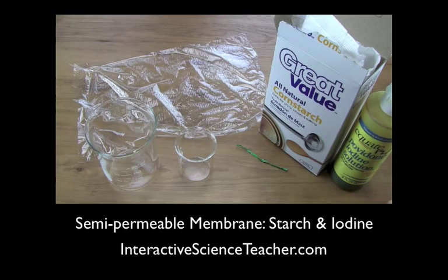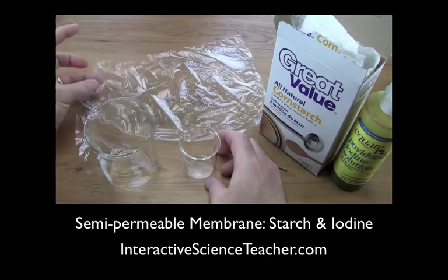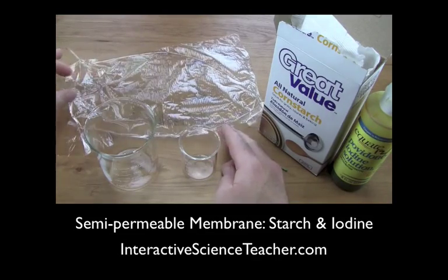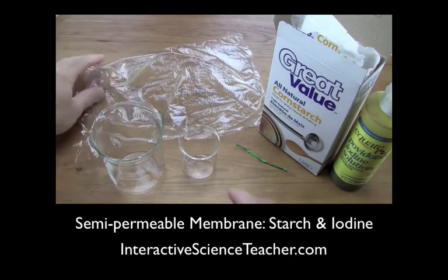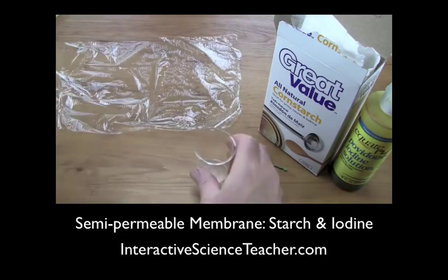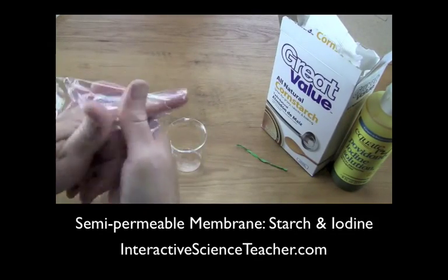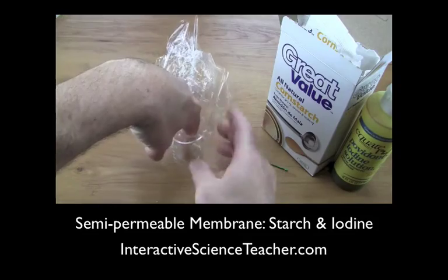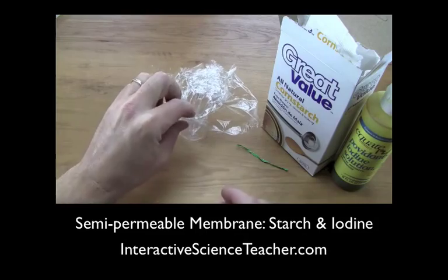It's not quite as quick or quite as good, but you can still do it and still get the same reaction. Here's what you need: a small beaker and a plain piece of plastic wrap — I've got Glad Cling Wrap here. Take a piece, stick your finger in the middle of it, and push it down into a small 50 or 100 ml beaker.